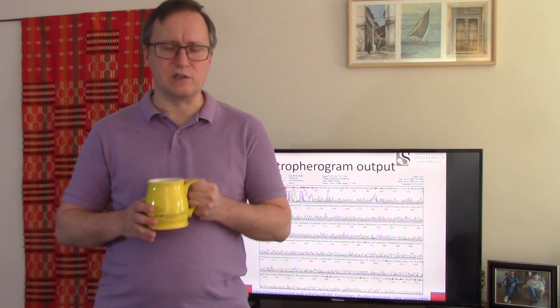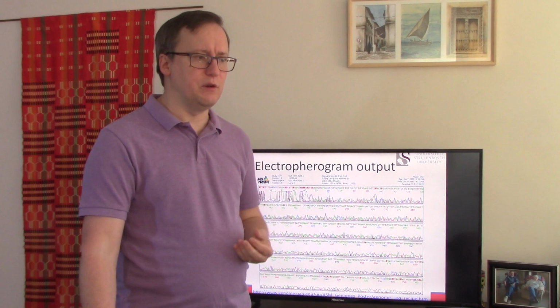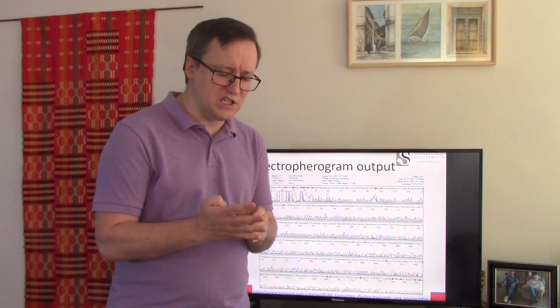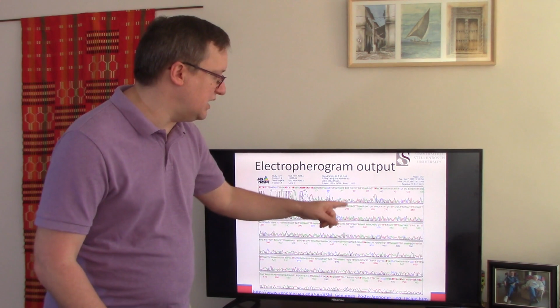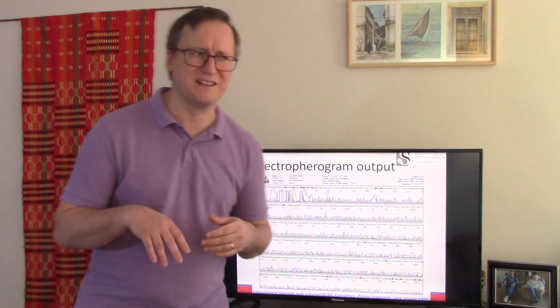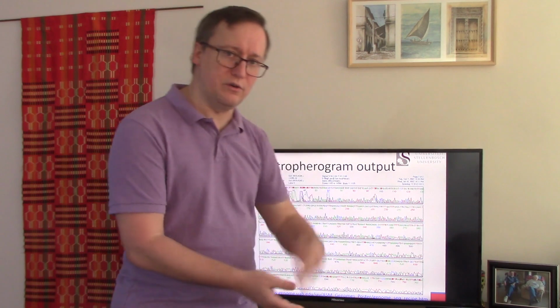So let's talk a little bit about what the information for each read looks like. The reads that we see in Sanger sequencing derive from something called an electropherogram. I think you remember a few slides back we talked about each of the letters A, C, G, and T corresponding to a different color. So here in this diagram we see that T is represented by a red dye, A is represented by a green dye, C is represented by a blue dye, and in this case G is represented by black. It's not a black dye, obviously, but each of these colors has this chance of waving up or down as a function of time in a capillary electrophoresis experiment.